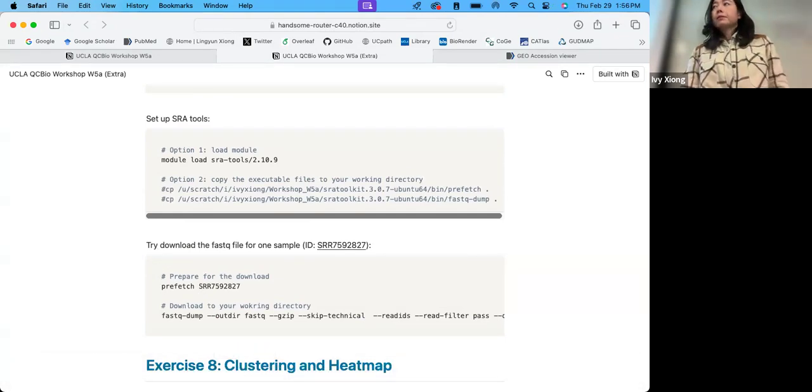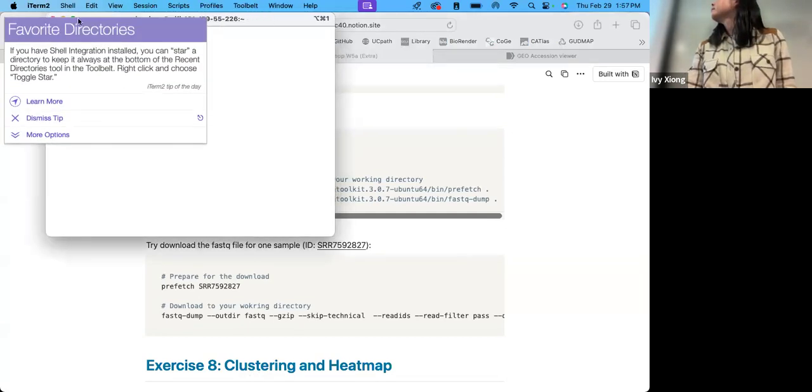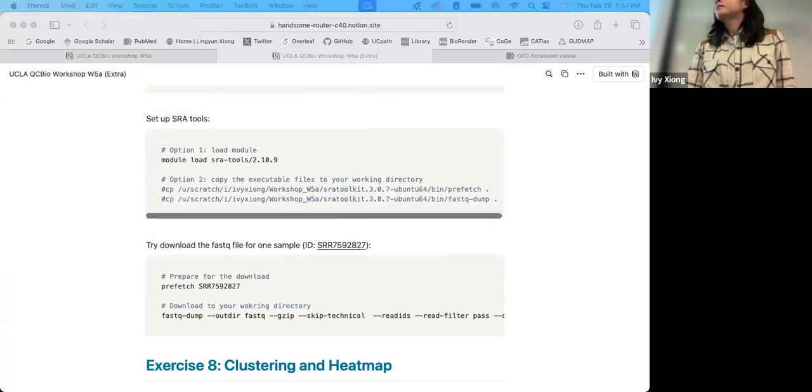Do you make a new directory for all these files? Yeah, I can. This SRA toolkit installation has not been configured. It's not configured, it says. Before continuing on Hoffman2, please run the configuration command. If you just copy the command and paste it, and then take the default. Where it says you need to run this first, just copy that whole line.